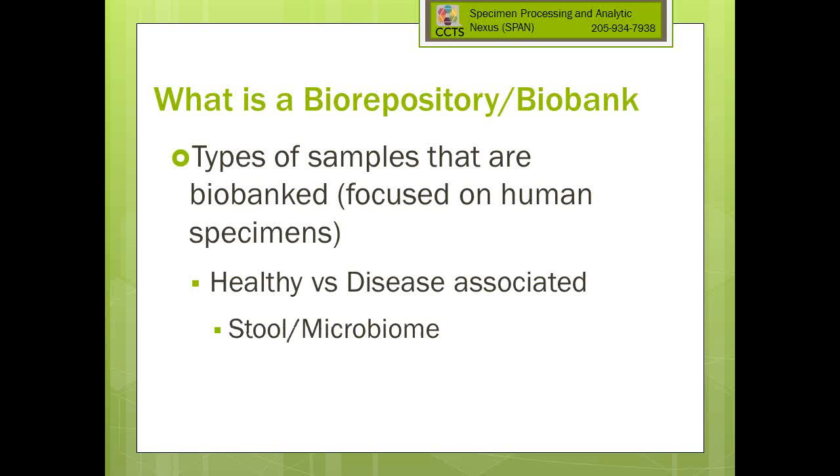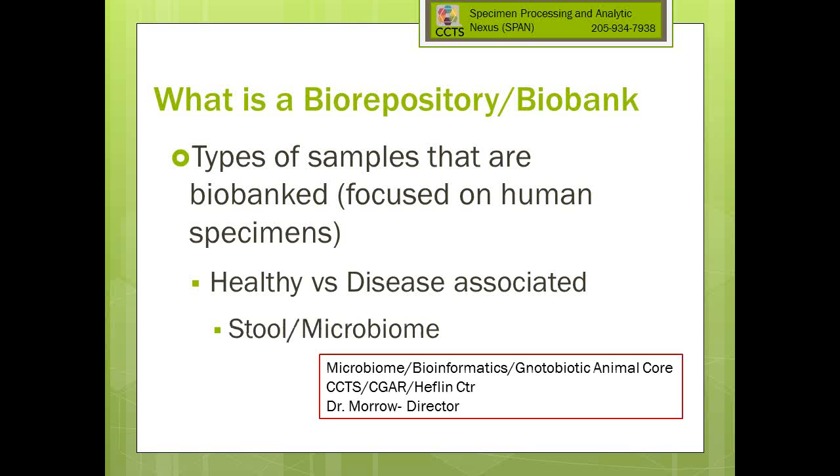And then lastly, there's a lot of interest in the role that the microbiome plays in health and disease. There's a lot of interest in collecting stool for microbiome analysis, and again, through the CCTS in collaboration with other centers on campus, Dr. Casey Morrow in cell biology leads an initiative where they've worked out all the details of specimen collection, shipping to the lab, and then working those specimens up for microbiome analysis. It's a very nice program where he integrates the collection, the analysis, and the actual data analysis together to help investigators look at the microbiome.